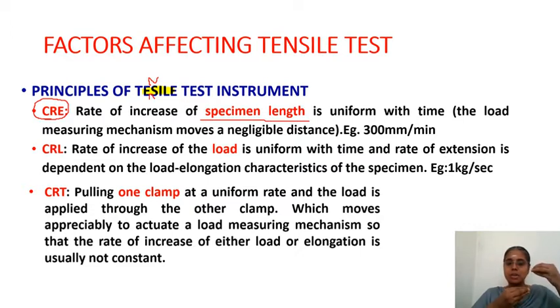Then, but it may not be at a constant rate. Either CRE will be constant or CRL may be constant. So these are the two important principles, and the next principle is CRT.